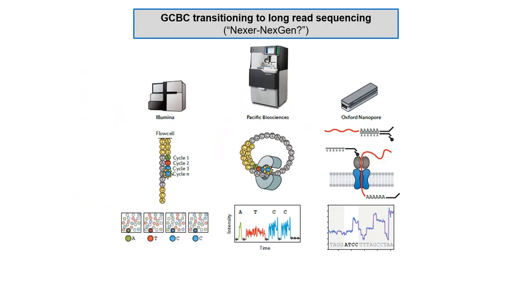Almost all of the genomic and transcriptomic data generated in the last 20 years has been from this kind of short read format. This is ideal for identifying local features in reads aligned to a reference genome, such as sequence variants or ChIP-seq peaks. It's also useful for counting the number of transcripts in a cell, if you only require that the read match somewhere in the transcript. But short reads have limitations in our ability to resolve, for example, the exon usage of mRNA isoforms, which average over 2,500 base pairs, or resolving large genomic variation, especially copy number variants.